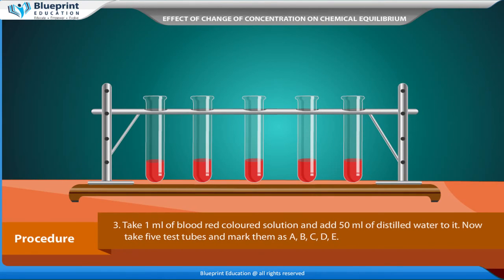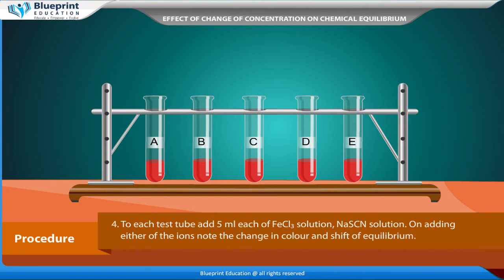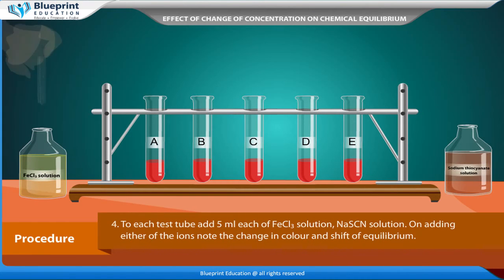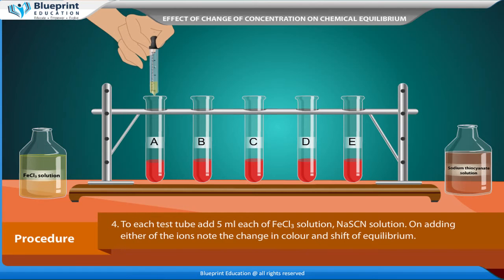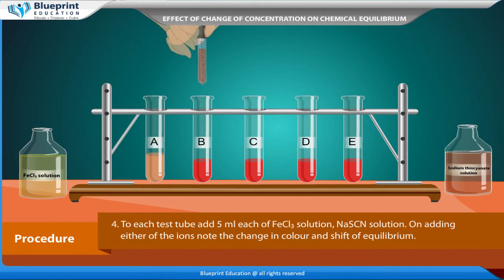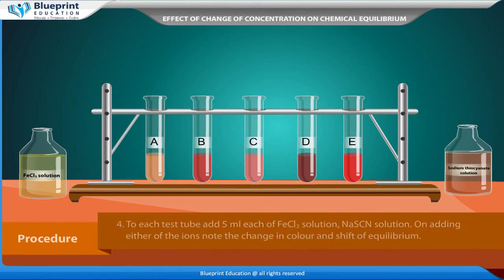Take 5 test tubes and mark them as A, B, C, D, and E. To each test tube, add 5 ml each of FeCl₃ solution and NaSCN solution. On adding either of the ions, note the change in color and the shift of equilibrium.